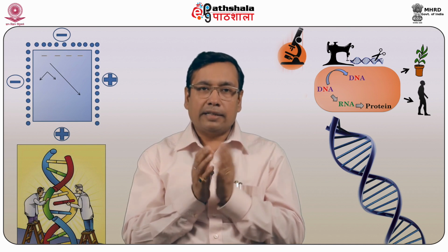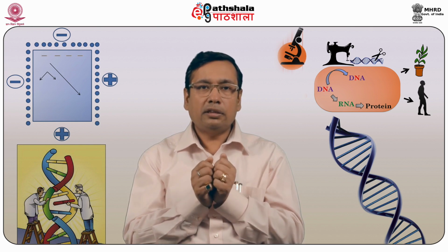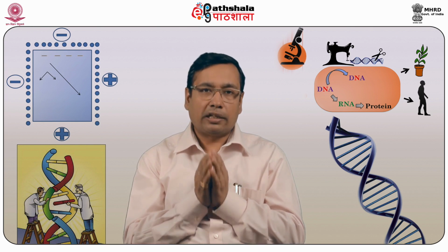As I discussed, it requires primers, Taq polymerase, buffer, dNTPs, template DNA, and of course a thermocycler.